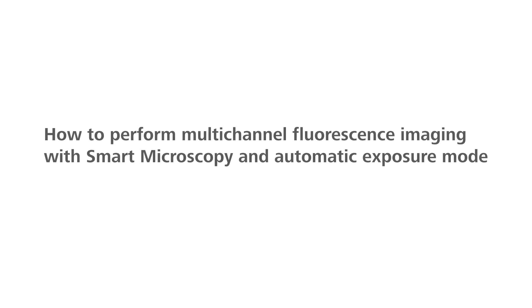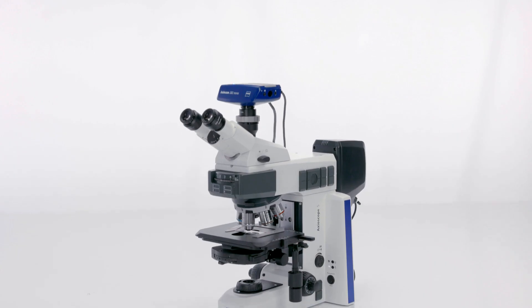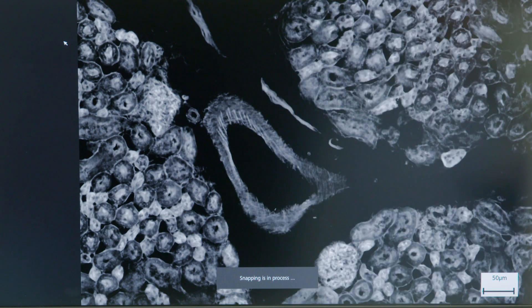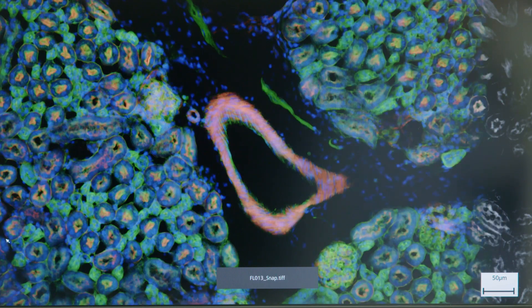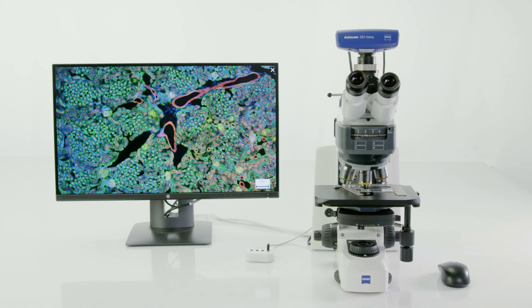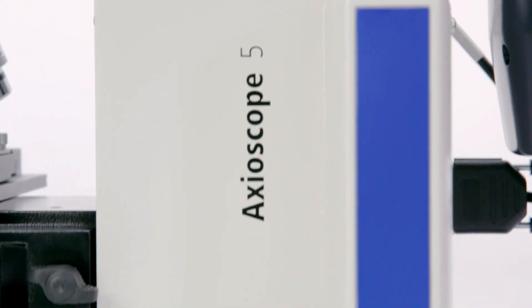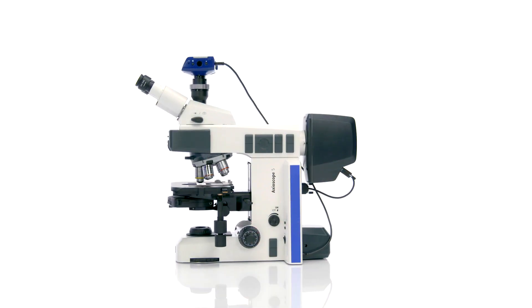How to perform multi-channel fluorescence imaging with smart microscopy and automatic exposure mode. Imagine being able to acquire overlaid multi-channel fluorescent images complete with the right scaling using just your microscope, even without a PC. With smart microscopy and Axioscope 5 from Zeiss, you can do it all in one go. Here's how it works.